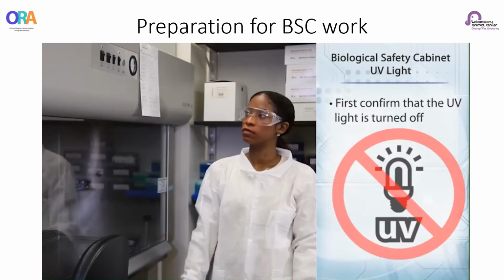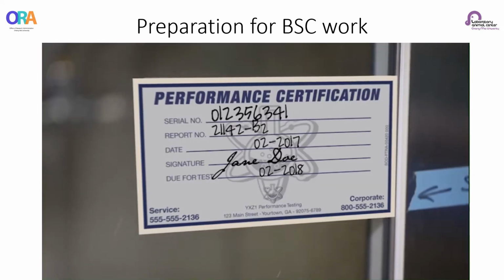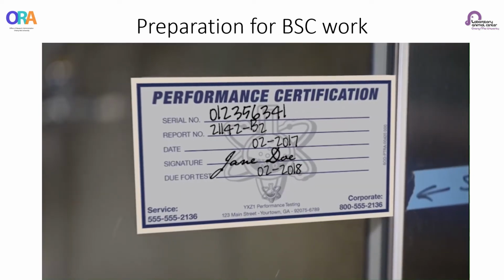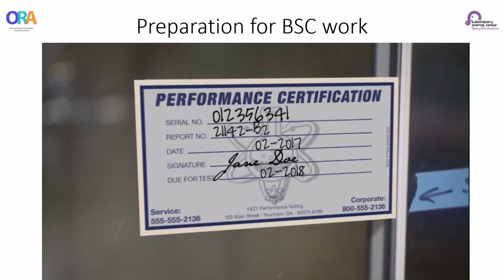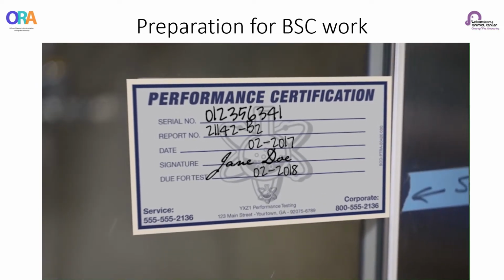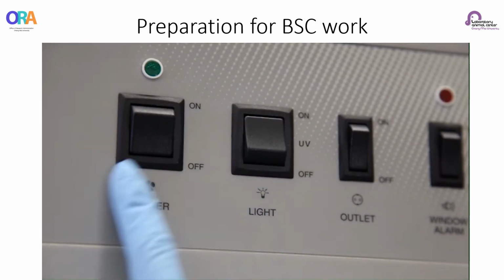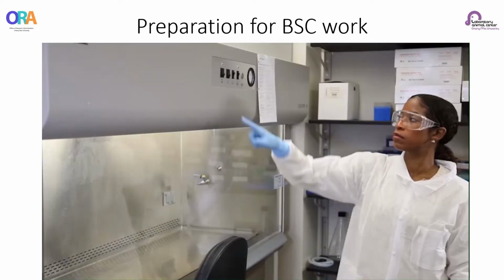First, confirm that the UV light is turned off. Then, check the expiration date on the BSC certification. BSCs must be certified when installed, whenever moved, and at least once annually. Next, turn on both the fluorescent light and the blower motor.